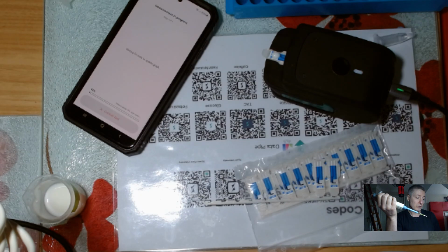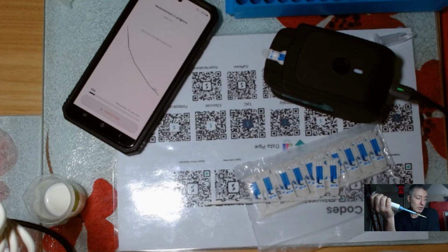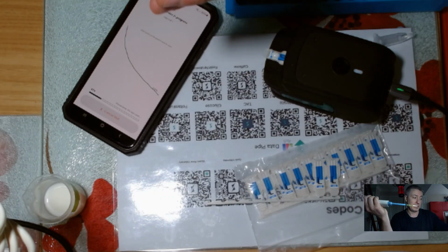So it's running along now. You'll see the data appear on my phone in real time shortly. Right, so I'll try and go through the maths quite quickly. I prepared a solution of about 21,000 ppm. I did an immediate 1 in 10 dilution on it, which I did here.